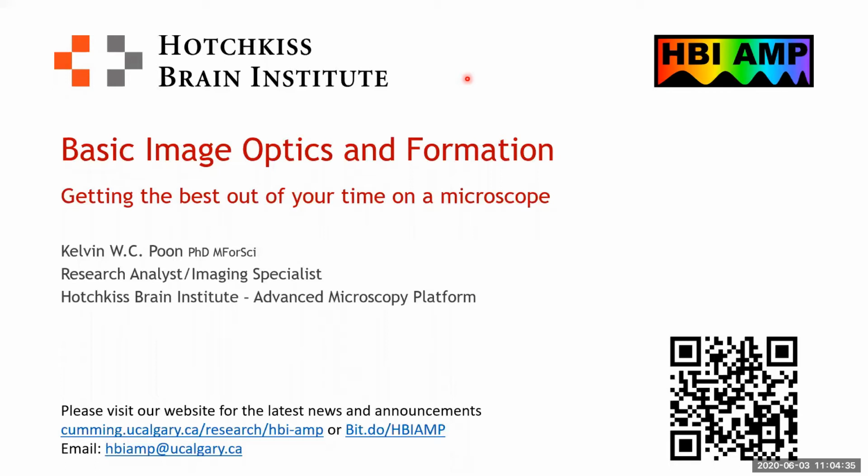This is so that you could at least see the importance of getting it right the first time when you're under the microscope, because let's be honest, it's garbage in and garbage out. There's no amount of image analysis, deep learning, machine learning that could pull data out of an image that you haven't taken properly or is compromised or corrupted in some way. So this is just a quick little thing that we put together, hopefully to get you familiarized with the concepts of getting from A to B on a microscope and getting the most out of your time on the microscope.